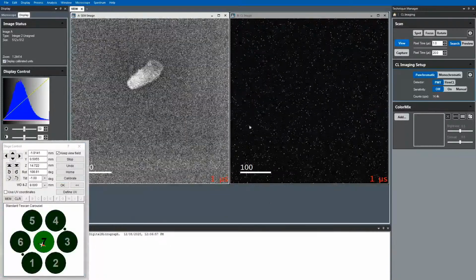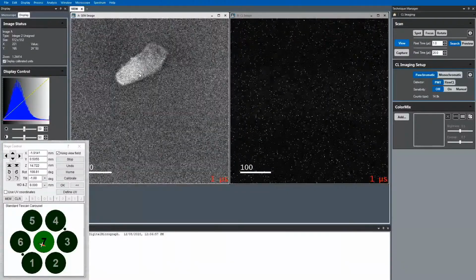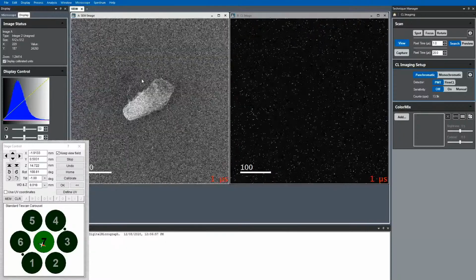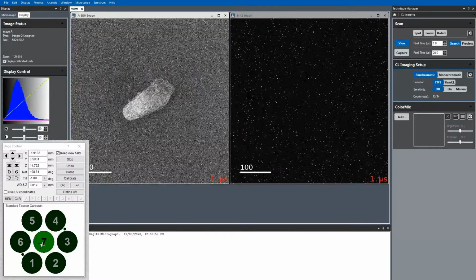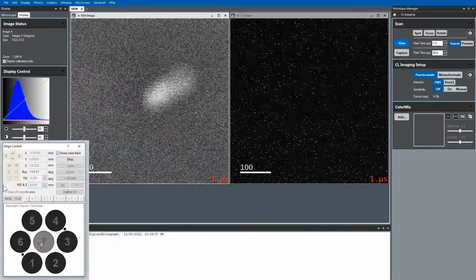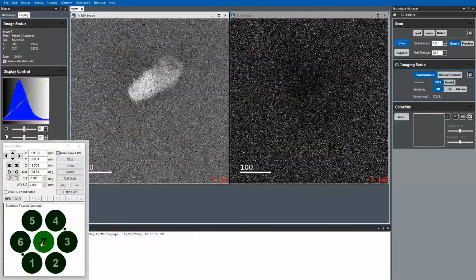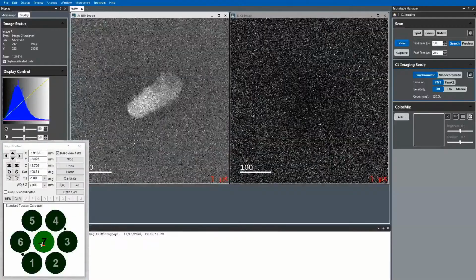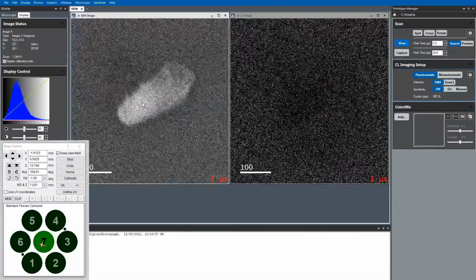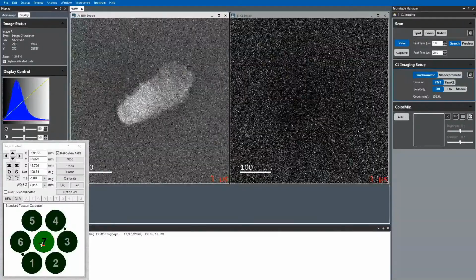So we're at 10.073. So now let's take it up to 8 millimeters. We have 14,000 CL counts. And after refocusing, we were at 8 millimeter. So now 7 millimeter. This step is really critical. If you hit the mirror, your experiment is done and your research may be done until we repair the mirror. So it's better to creep up on it and go slowly as opposed to just going straight to 6.